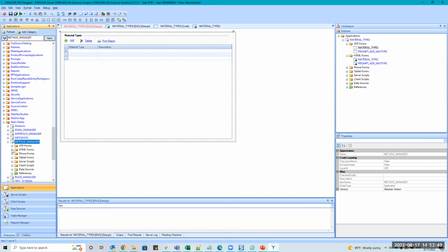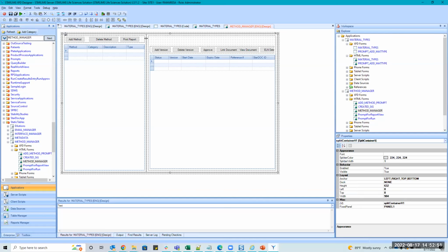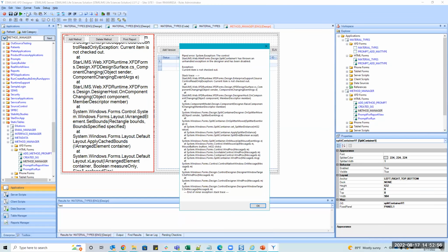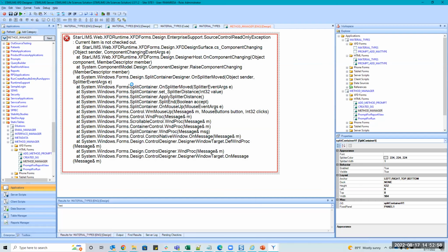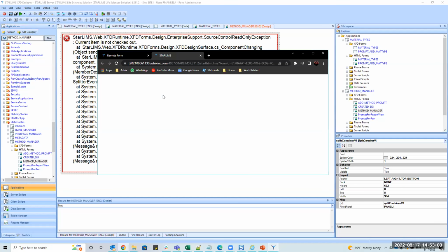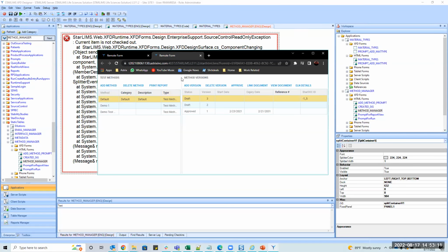But the idea behind the splitter is it's actually a pain point for a lot of our customers. So let me show you. Yeah, these are splitters. Let me run this. Some of them are really hard to grab, and STARLIMS gets a lot of complaints from the customer. So this is a splitter. You can see you have to put the mouse precisely, and I think we've all been in the application, we've seen this and come across it, and we find it painful as well.